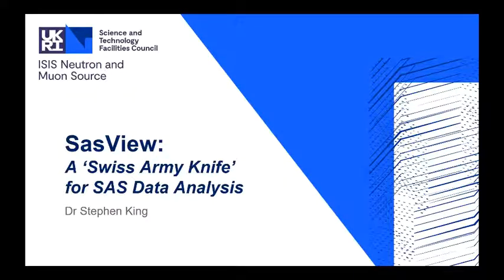So this session is about a software application called SasView, which, as my subtitle there alludes to, offers a number of options for analysing small angle, very small angle, or even ultra small angle neutron or X-ray scattering data. There is at least one person I know of that even uses it to analyse static light scattering data.